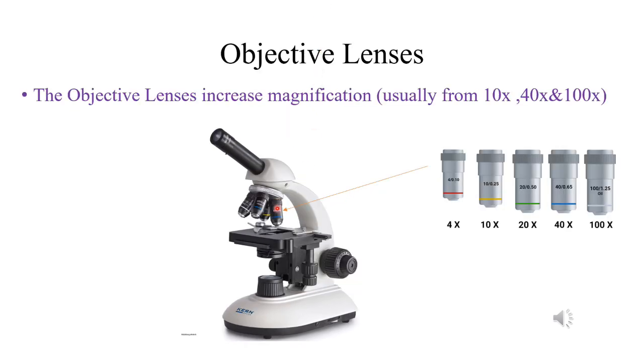Objective lens. The objective lens increases the magnification of the image. In a microscope, two types of lenses are used. The first one is the objective lens, and this is the ocular lens or eyepiece. When the light rays pass through the specimen, they enter into the objective lens. So the objective lens will magnify the image.